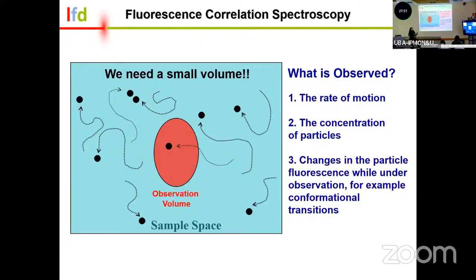All right, so now back to modern days, no longer in the 1900s. How do we do this in a microscope? In a microscope, we have optics that allow us to focus the laser beam in a very small focus spot. This is called the volume of the point spread function, or PSF. There are many terms for it. So this observation volume enables us to calculate the volume of that point spread function, whether we're using 1 photon or 2 photon excitation, we have to calculate the geometry of this volume.